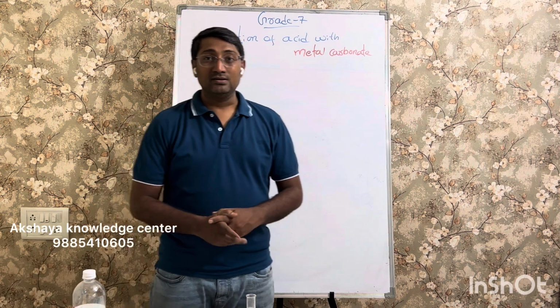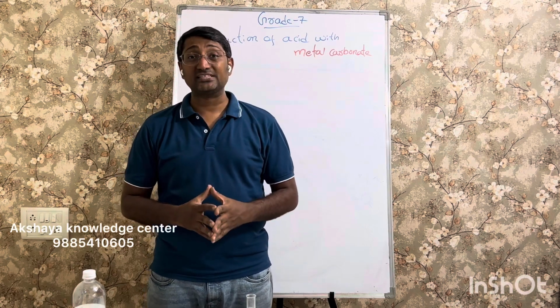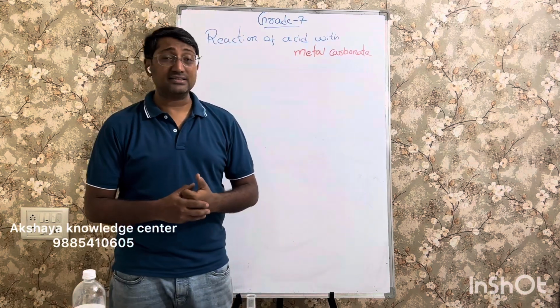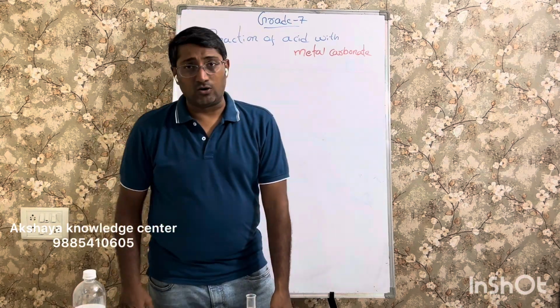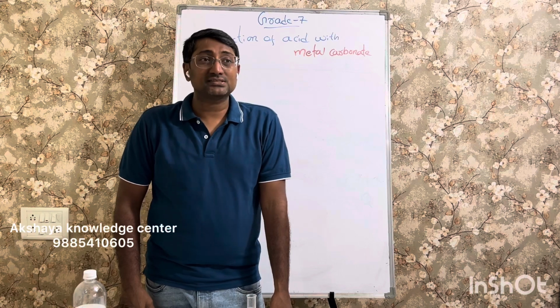Hello everyone. You have seen a very interesting experiment last time, that was the reaction of acids with metals. Now I have another experiment, that is the reaction of acids with metal carbonates, or even metal bicarbonates. Before we start, I have again a few questions.